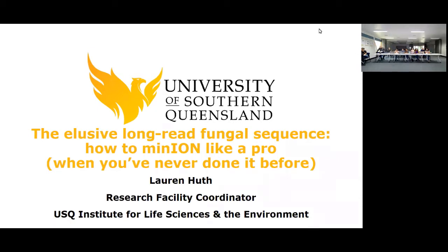Thanks for coming along. I'm really happy to be able to give this presentation today. Like the title suggests, it's about the minION, and really it's just a beginner's overview of the minION. This is something that I've been working on for a couple of years, particularly with Oxford Nanopore, minION before that. I just really felt like this was a presentation that I would have liked to have seen before I started.